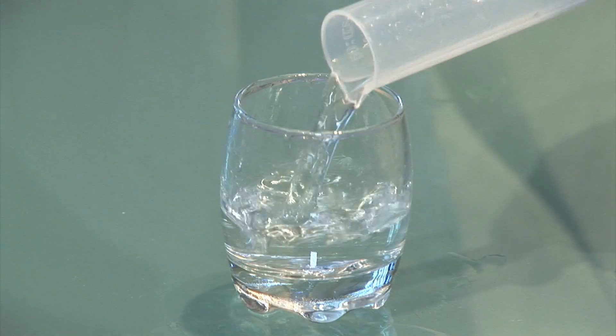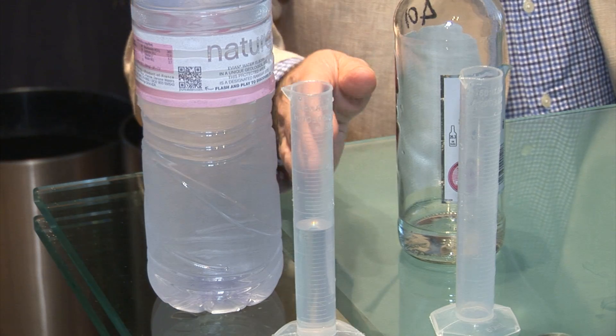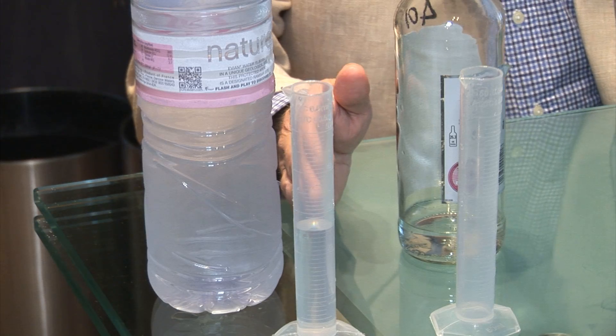Hello, I'm Paul Hisco from PH7 and today we're going to show you how you can measure the ethanol strength in vodka. We have here 25 milliliters of vodka from a well-known brand which claims to be 37 and a half percent alcohol. We have a similar measure of water which we'll use in a moment.